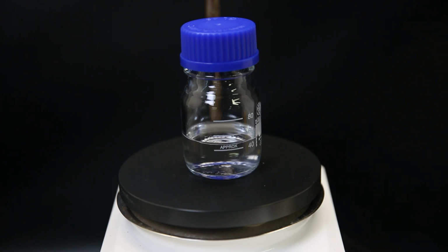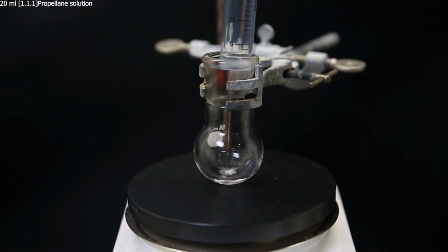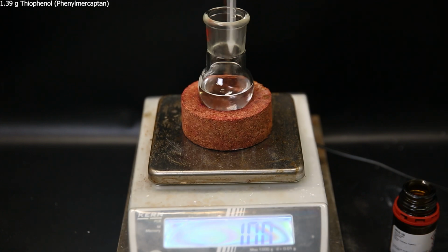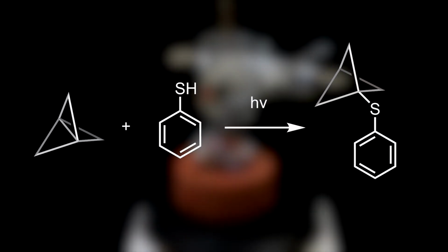So to test if there's truly propellane in here, I set up a small flask with a stir bar, and add in 20 ml of the propellane solution. Then, I add 1.39 grams of thiophenol to the flask, which is in excess, to make sure all the propellane reacts. I then leave it to stir for 15 minutes at room temperature, while it is standing in normal room light. In the reaction, 1,1,1 propellane reacts quantitatively with thiophenol to form bicyclo-1,1,1-pentylphenyl sulfide. We can then isolate and weigh the product and see how much propellane was in the tested solution.